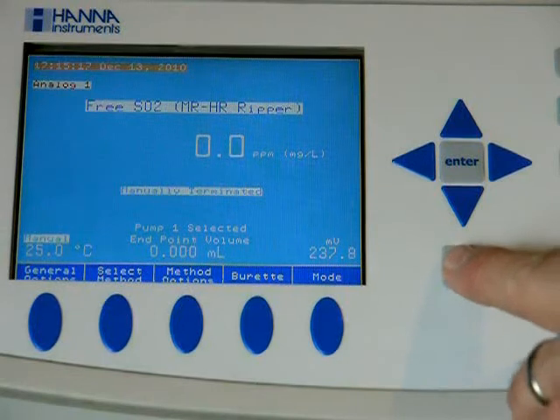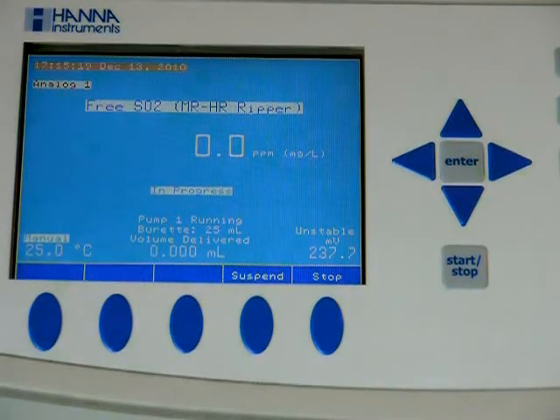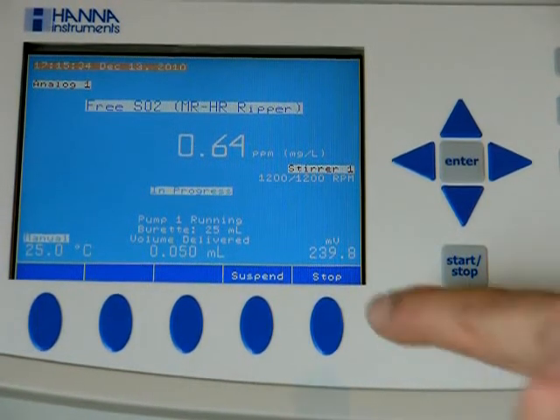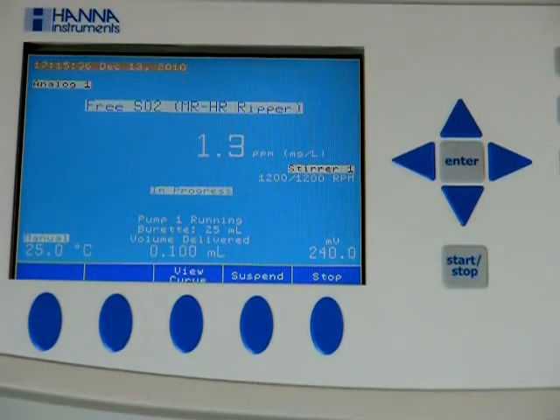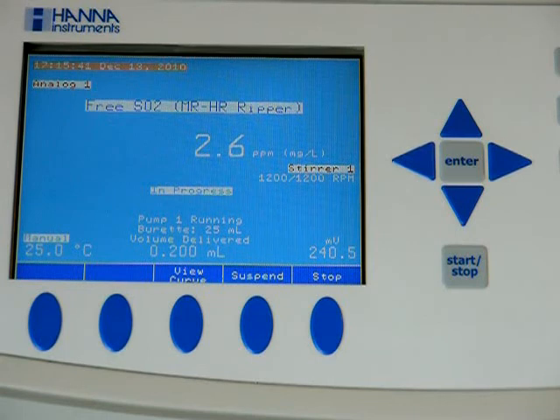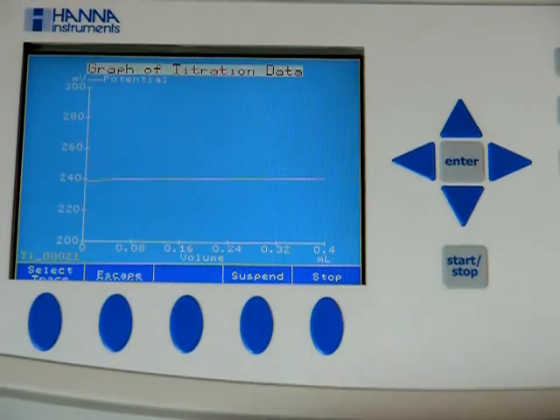And we'll hit start on our free SO2 test. We have our running millivolts in the bottom right-hand corner, the volume of titrant delivered in the bottom middle, and our running total of parts per million in the middle of the screen.